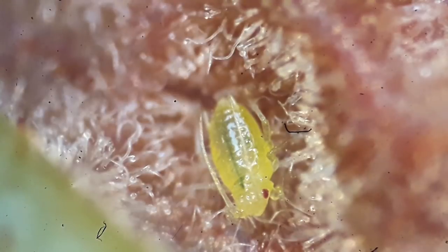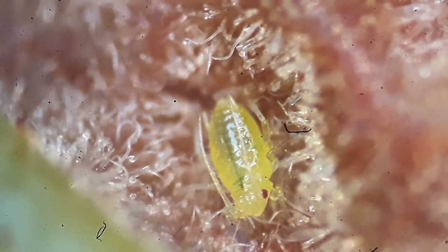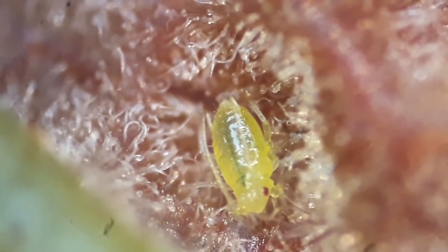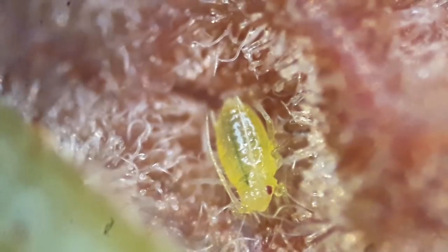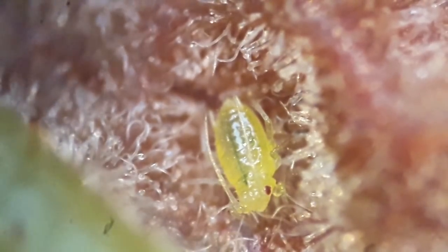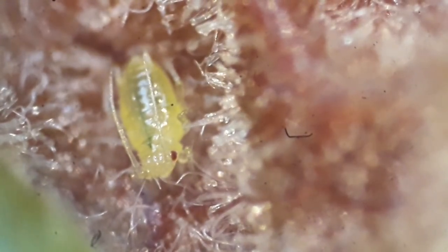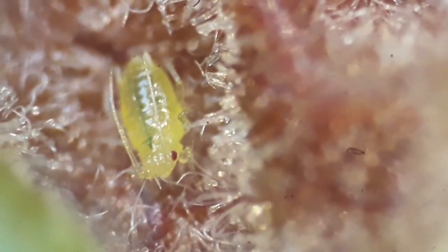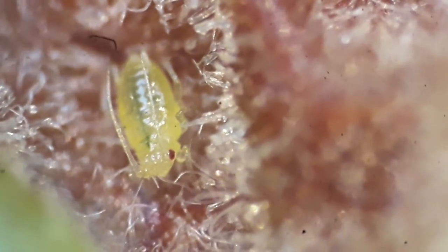It looks kind of cute — nice red eyes, not moving at all. Basically what it's doing is sucking the sap of the leaf; that's its food. I also noticed the lens is a little dirty. You can see quite a bit of dust on the lens, and when you rotate the eyepiece the dust also rotates, so I have to clean the eyepiece of the microscope — not a big problem.